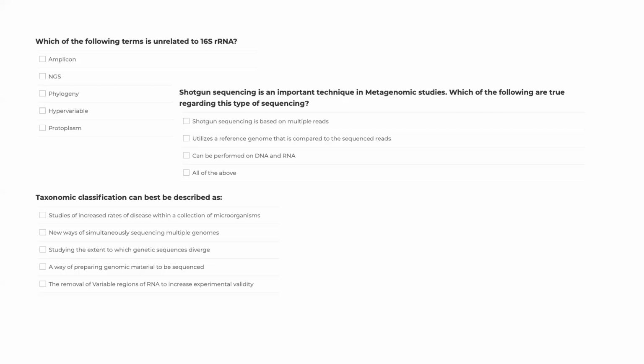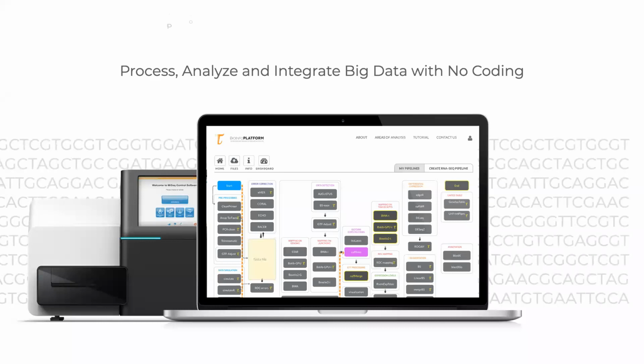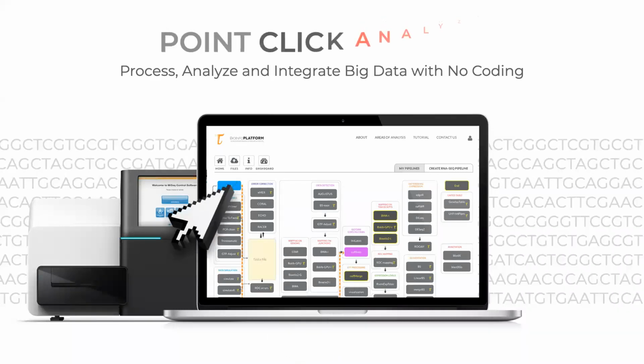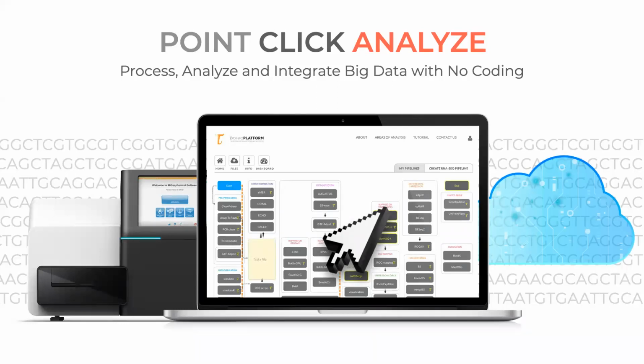So to analyze this kind of data, as I mentioned, initially you do not have to have any background in coding. In fact, we will use a point-and-click interface to understand the logic of analysis, and this logic of analysis will clarify why we are taking certain steps and what is the objective for each input and output in this process. So these are going to be called bioinformatics pipelines.